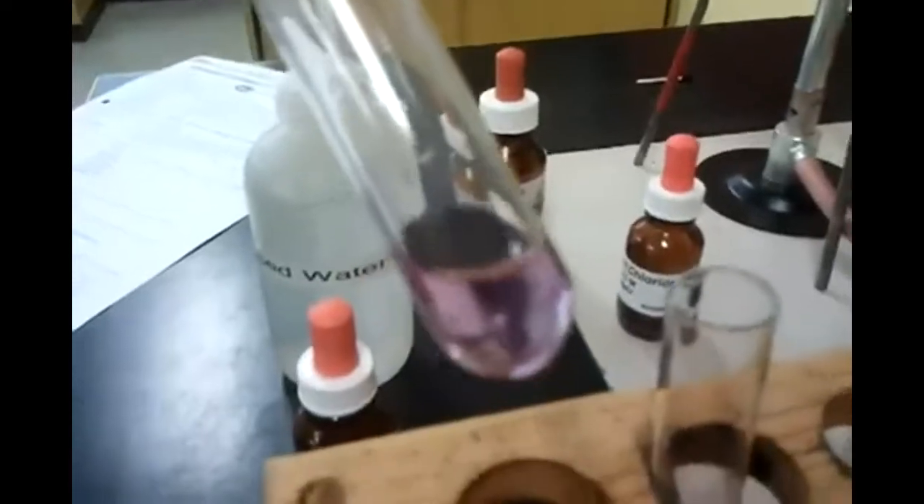We're putting litmus solution into each test tube to see what color it is. So water — what's the original color of the solution? Purpley. Yeah, so that's the color — it looks the same. It's purpley.